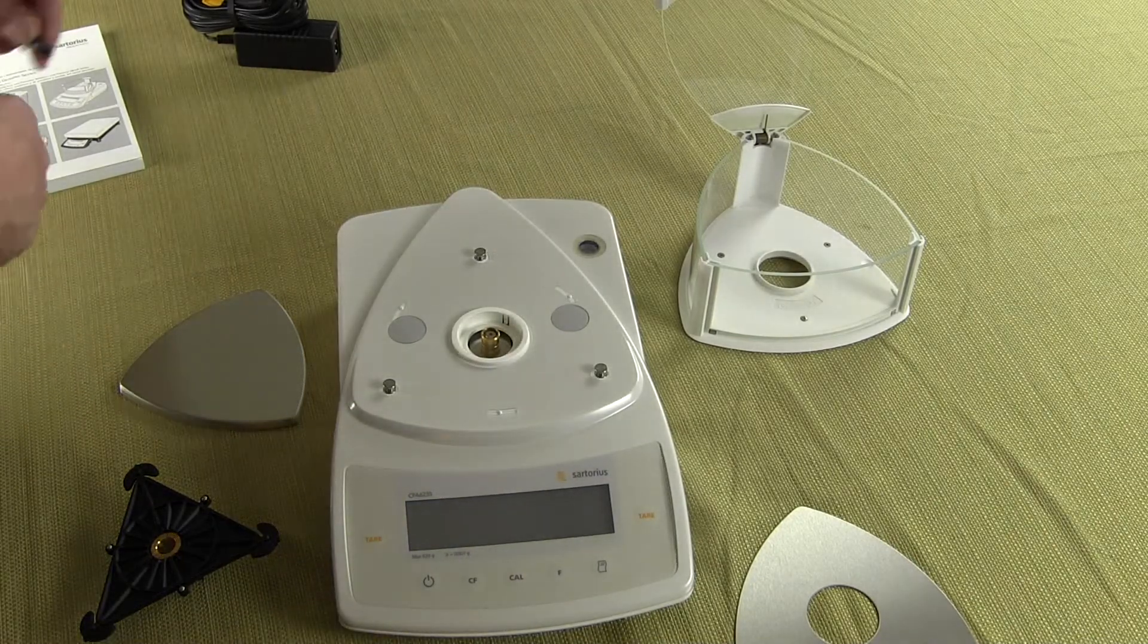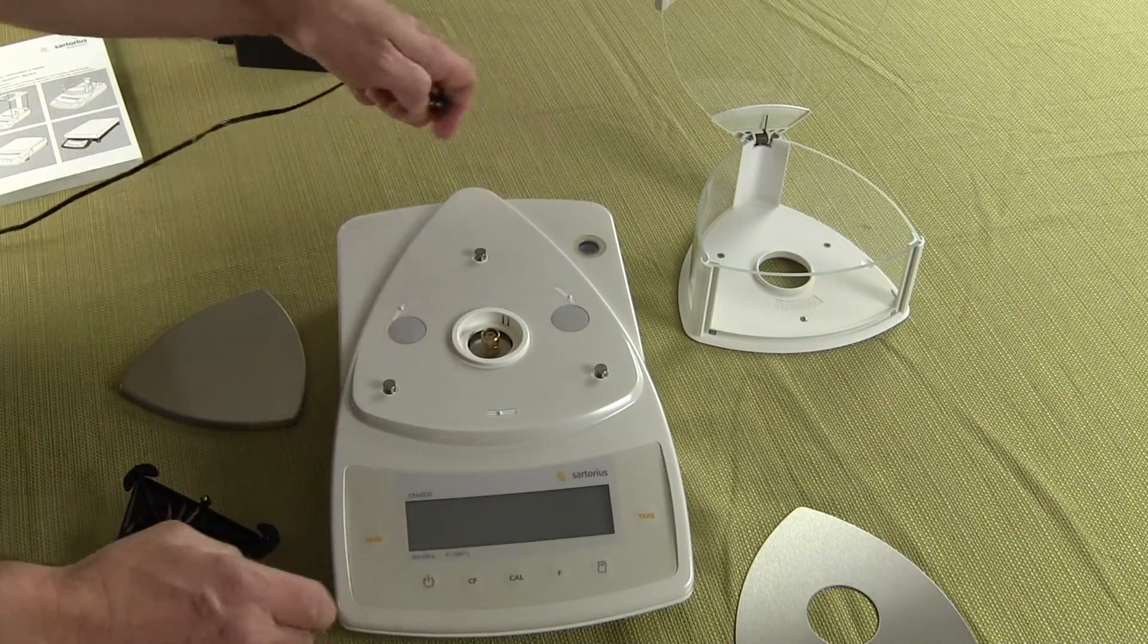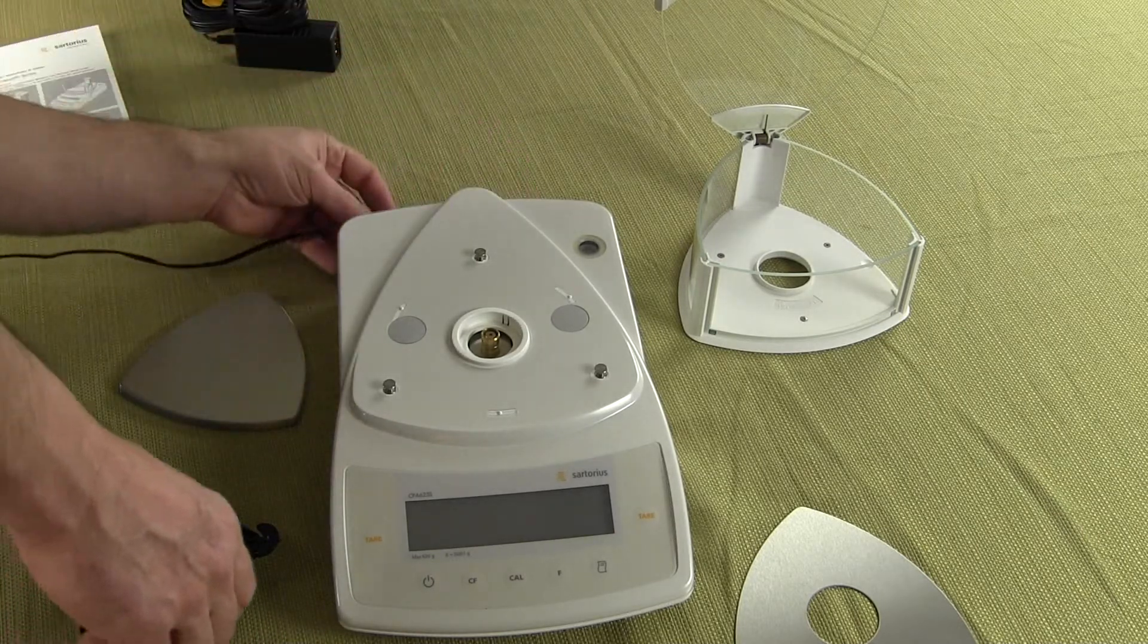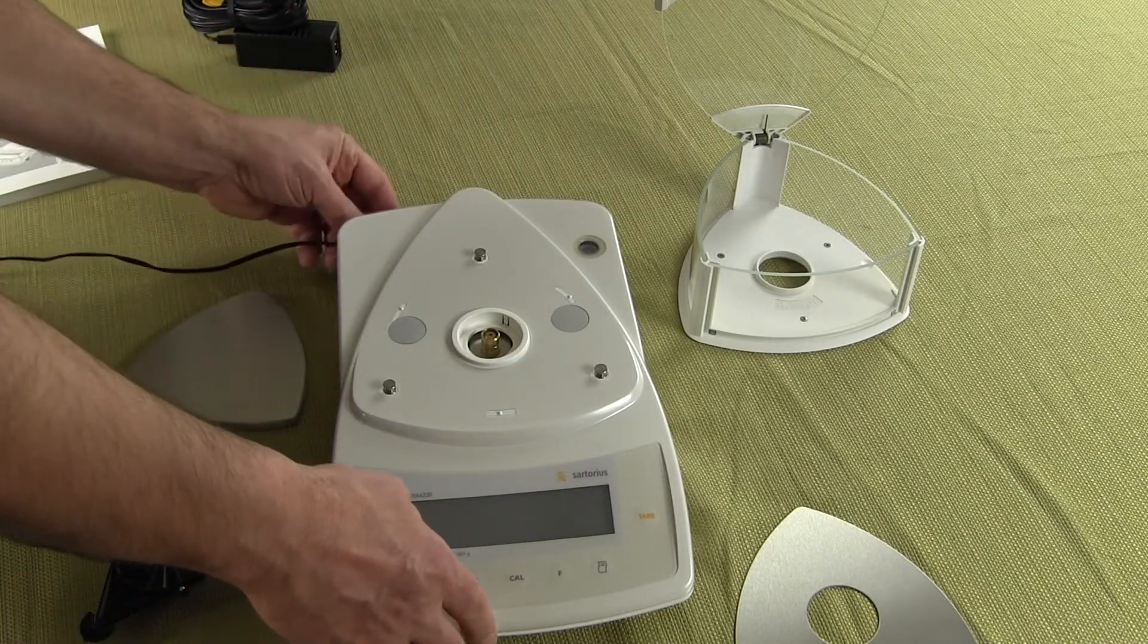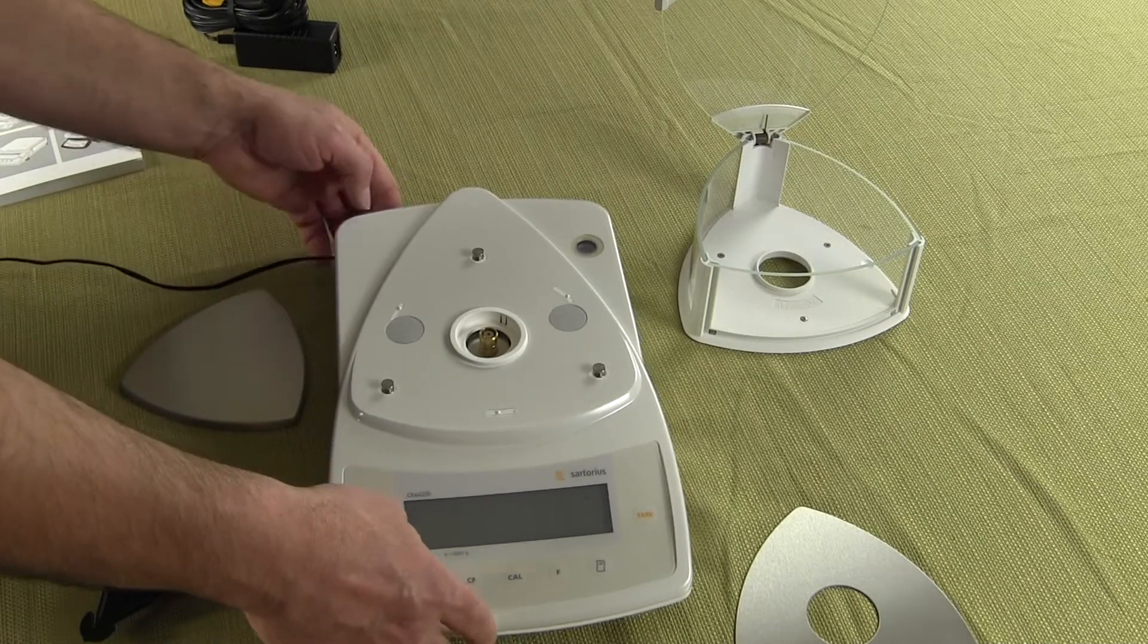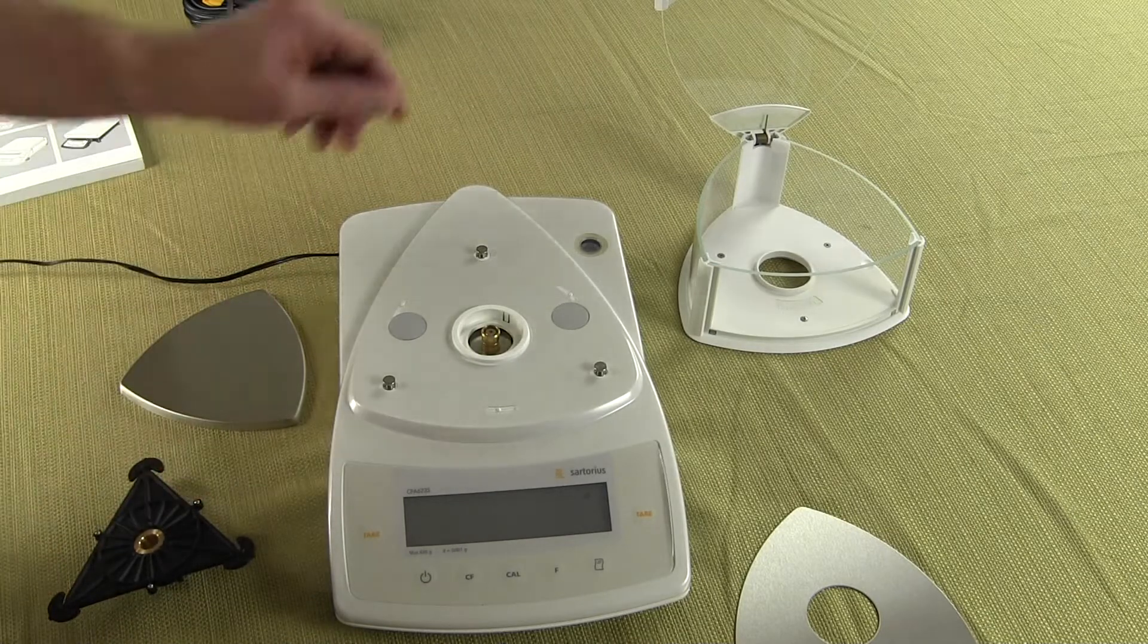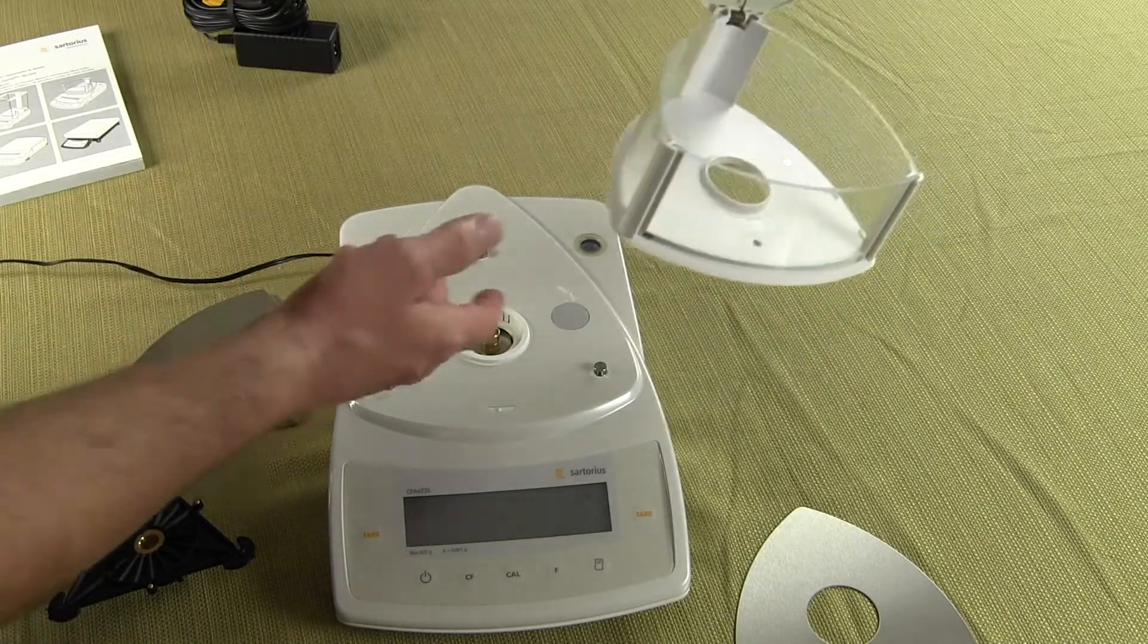So the first thing you want to do is level the balance and I've already leveled the balance so we're all set there. And we want to power up the unit. Plug in the AC adapter to the rear of the balance. And the first thing we're going to do is our draft shield.